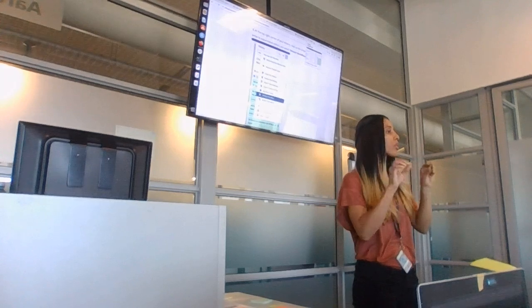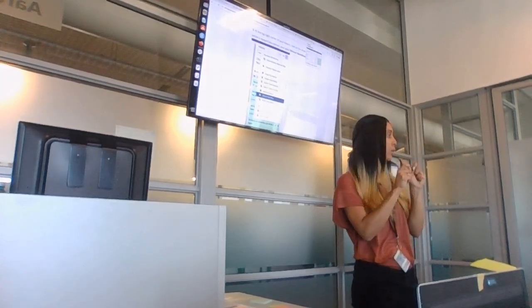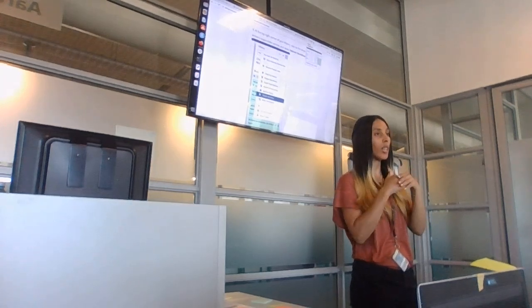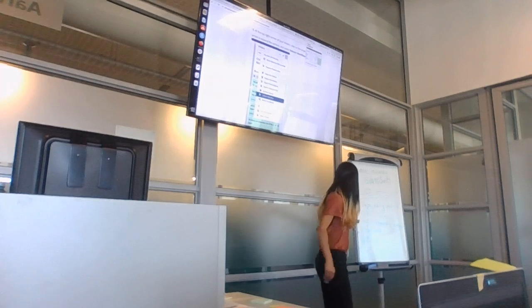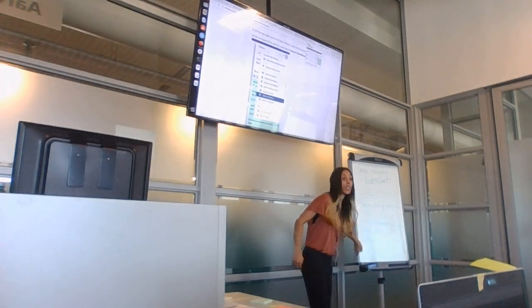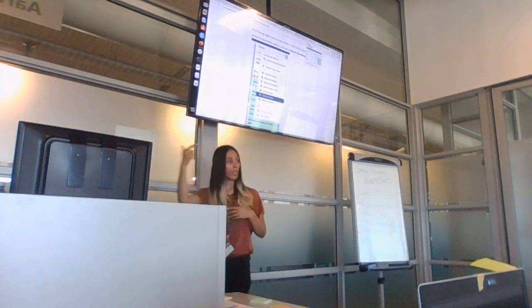I just did it separately because I wanted to show you how to do different analysis and how to drag things apart. But in this case, you would put Kraken as your next tool. So after running FastP, MultiQC, Kraken, right? And then you would create a workflow from that.